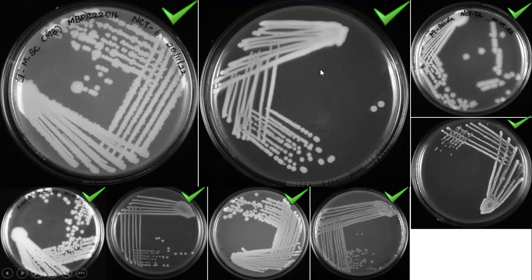You make a mother line here, and from here, there are various ways to do it, but this way I would recommend, you will get an isolated colony, which is the ultimate objective of doing a quadrant streak. The last quadrant is a way to see whether your bacteria is unique or not. So better get an isolated colony so that you can study the colony morphology.